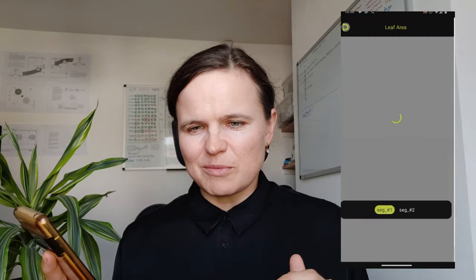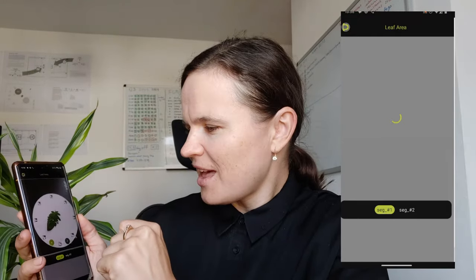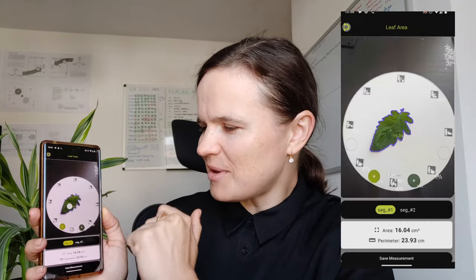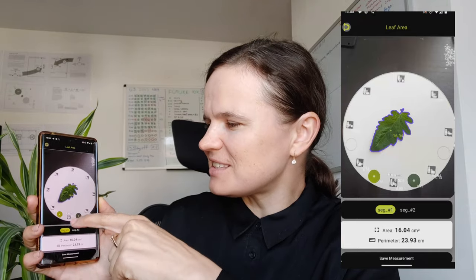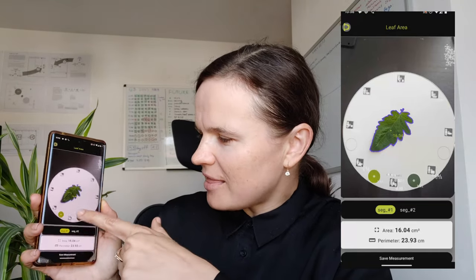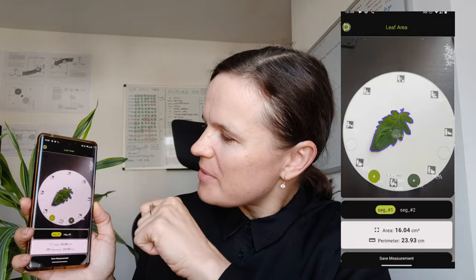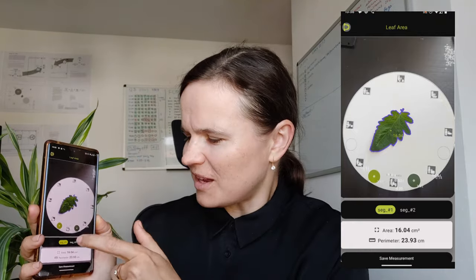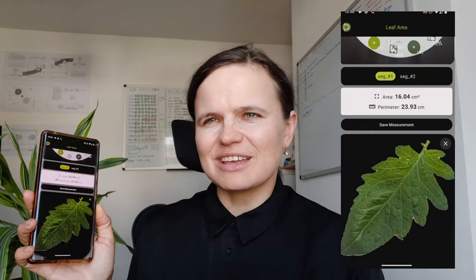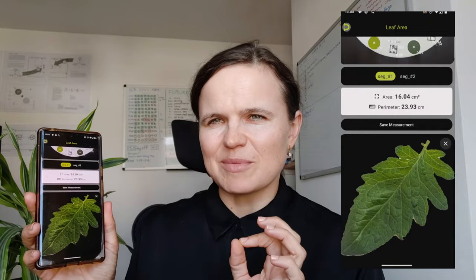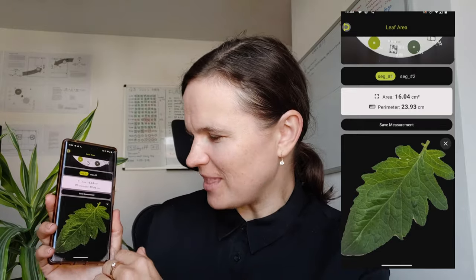You take a photo and then upload it into the mobile application — just press photo. Here we are. This is our leaf and this is the area of the leaf. According to the measurement, it is 16.04. If you touch it, you will see the violet border — the violet contour of the leaf. And if you scroll down, you will get the measurement in more detail and see how good or not good the segmentation is.